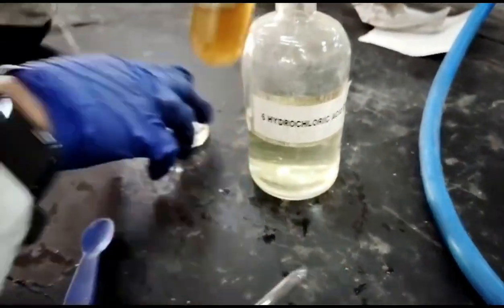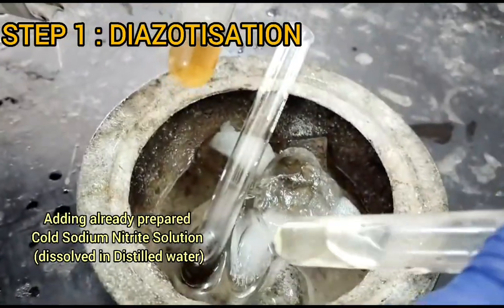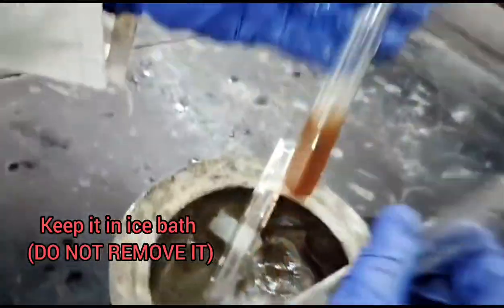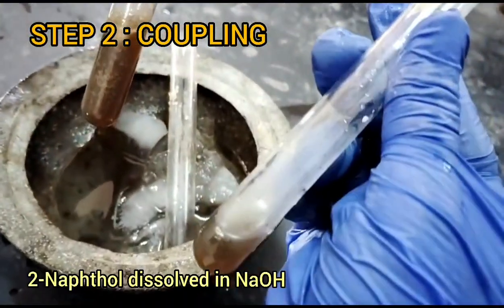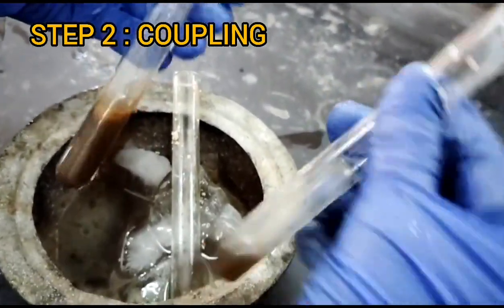Now to this we will put cold NaNO2 solution. And now we will add the beta naphthol solution that we prepared in NaOH.